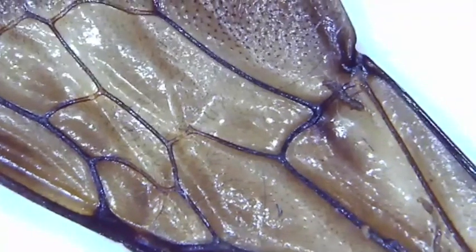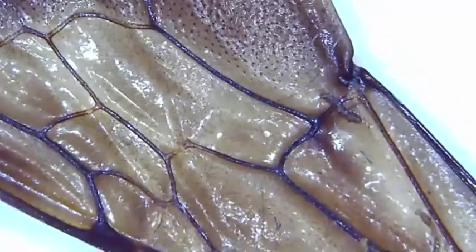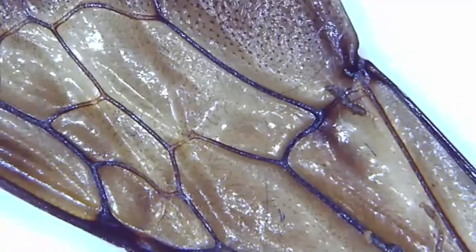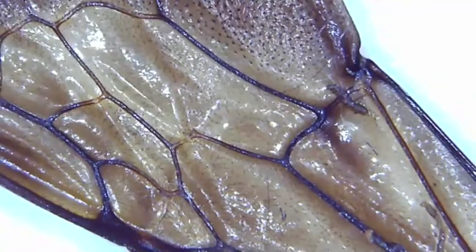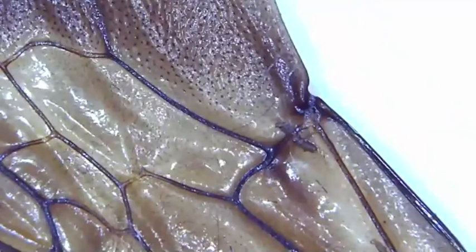So this is actually a wing. It's not from a butterfly, but does anyone want to make any other guesses as to what it could be from? Ani? Trey in the chat says moth. Ooh, a moth. Yeah, so it is an insect. You guys are on the right track.